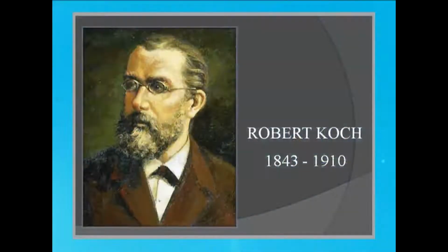It was Robert Koch who gave us the idea of microbiological medium. What is this medium? This is a food base or a nutritional source that is given to microorganisms when we want to artificially culture them.